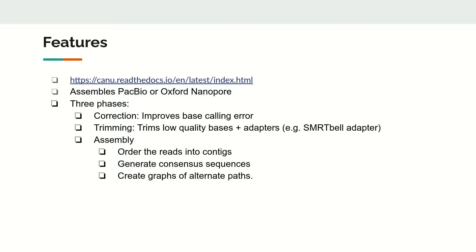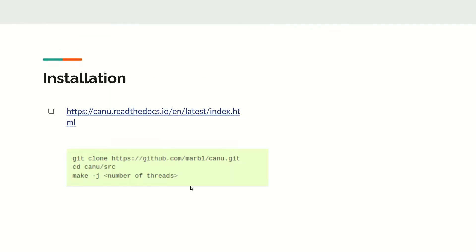Installation is simple. We need to clone the repository, change into the directory, and type make with the number of threads you want to use.